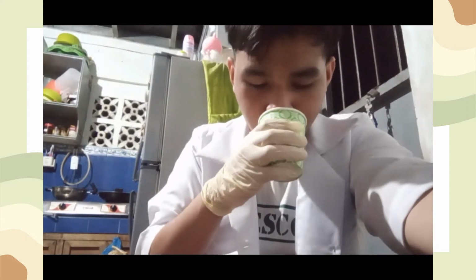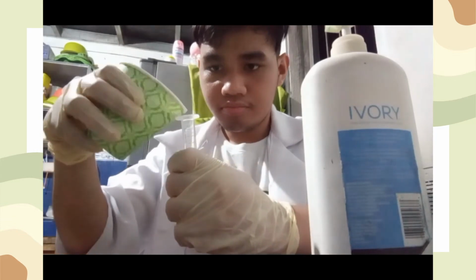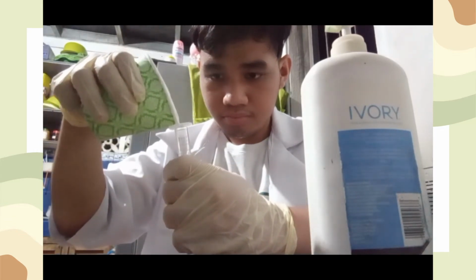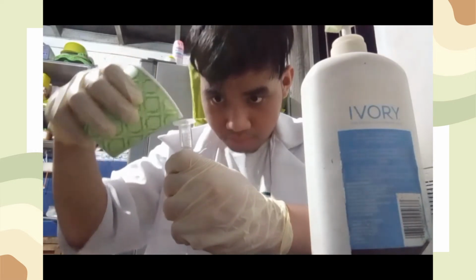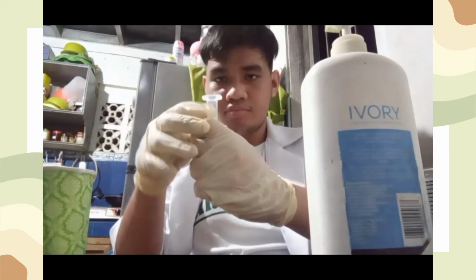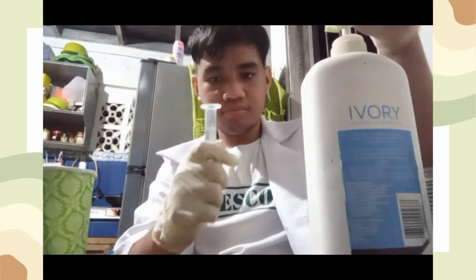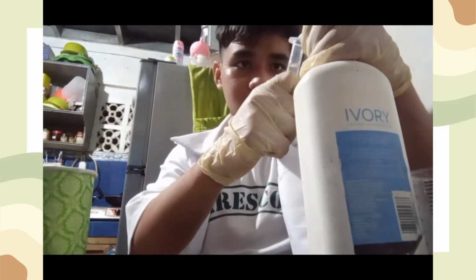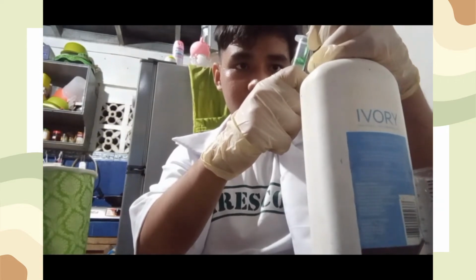And then we're gonna spit our mouthwash solution back into the cup. And then we're gonna bend the cup into a sort of spout and pour the mouthwash solution into the test tube until it fills about 1/2 inch of the bottom of the test tube. After this, we're gonna carefully add 2 drops of the liquid soap.